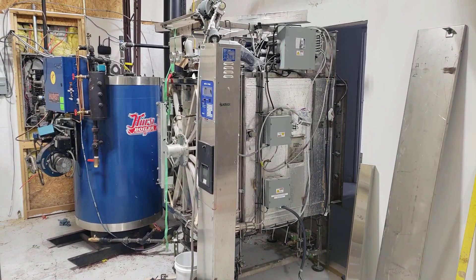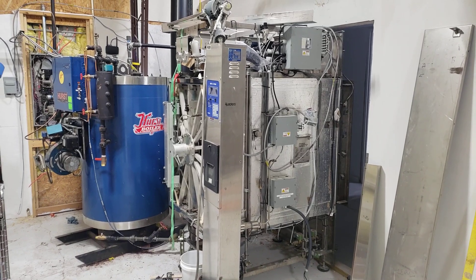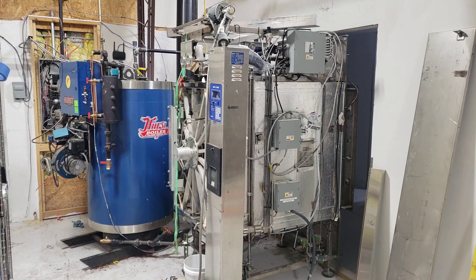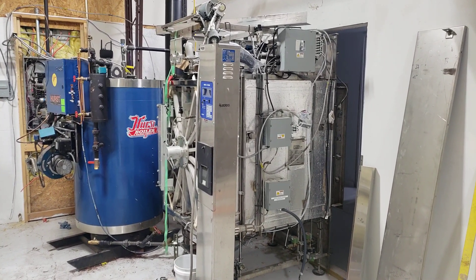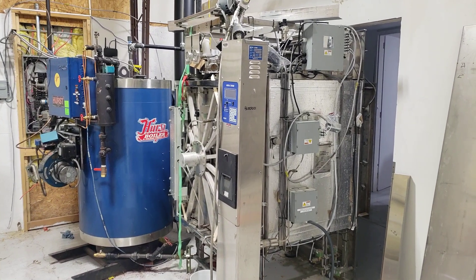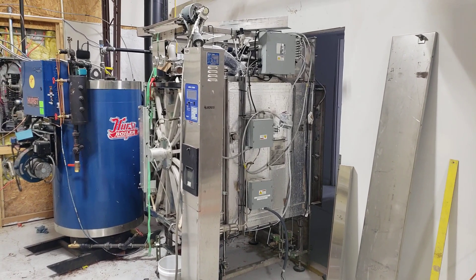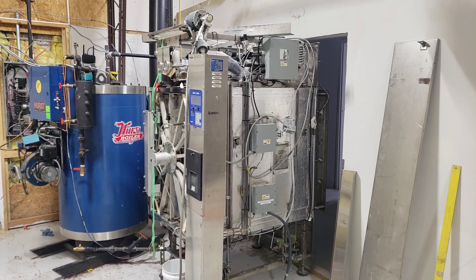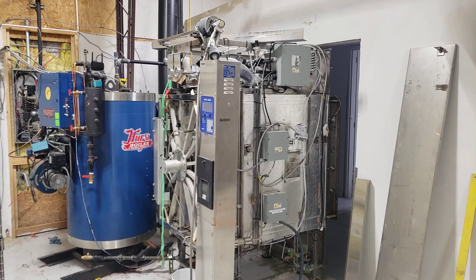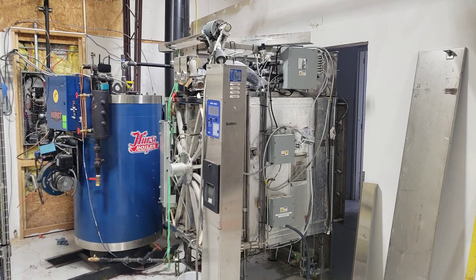One of the first things you're going to be looking for is a used boiler and autoclave. You can buy new, but they're going to be extremely expensive — that boiler right there is about $15,000 to $20,000 new, and this autoclave is somewhere between $30,000 and $60,000 new. I got the boiler from an old laundromat and the autoclave from a company called Aaron, an equipment reseller. You can also find them on eBay. Shop around — look on Facebook Marketplace, Craigslist, and eBay.